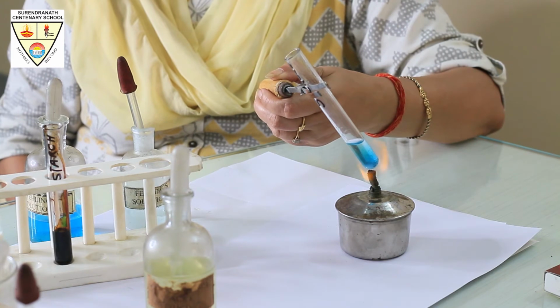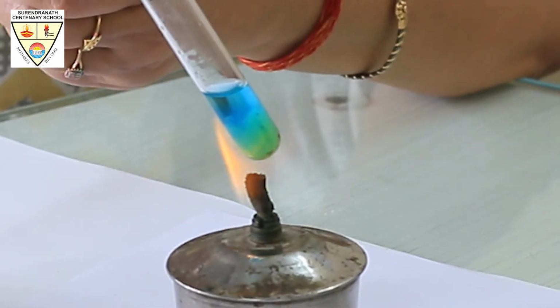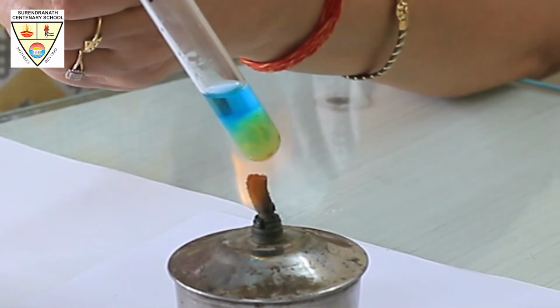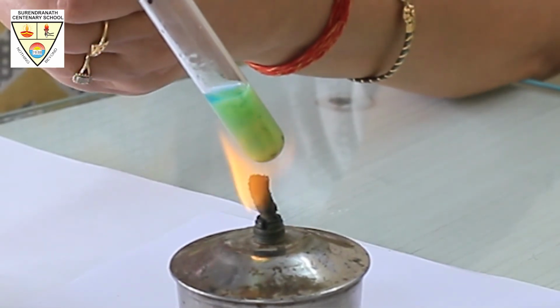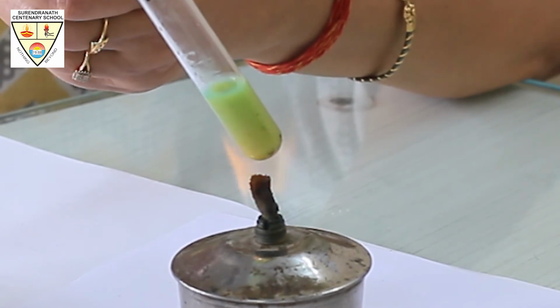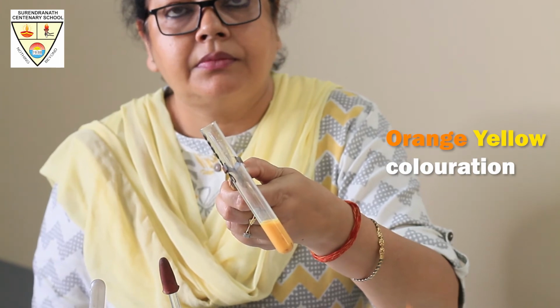For that, you need to take the test tube and hold it with a test tube holder on a spirit lamp and boil it for a few minutes. You will slowly see the color changing to orangish yellow. This confirms the test for glucose or monosaccharide.